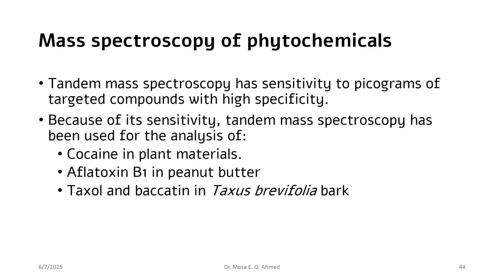In mass spectrometry and elucidation of naturally occurring compounds, the use of tandem mass spectrometry, or MS coupled techniques, can make the method highly sensitive for picograms of target compound with high specificity.